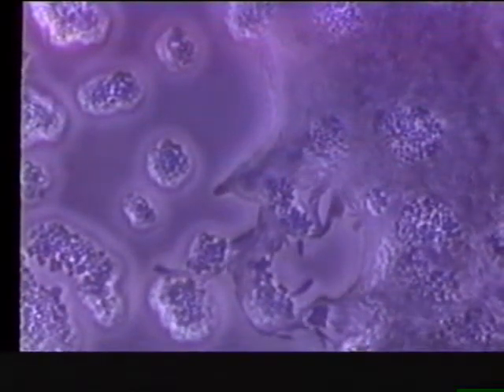Here we see some tips of swarms leaving the Micrococcus and going towards other colonies. And it appears when they do this that they do not go directly towards the Micrococcus until they're sufficiently close to it. Then they zip right in.